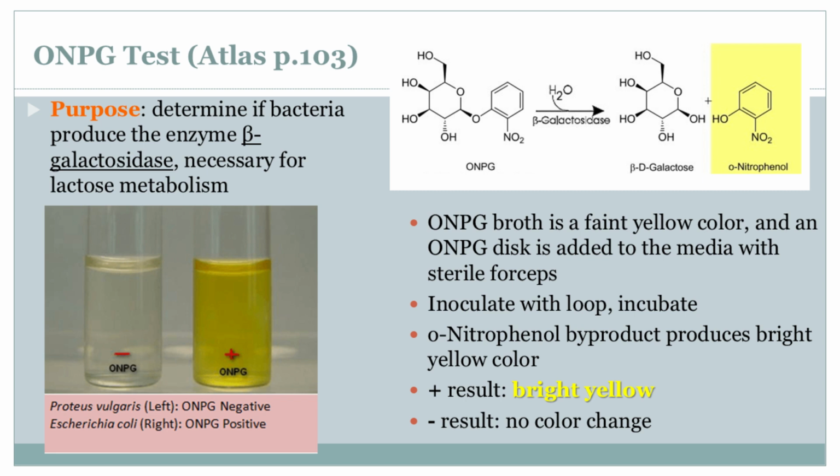So picture this. You've got a test tube with our bacteria suspects in it. We add the ONPG, and if those bacteria start producing galactosidase to break it down, boom, the whole solution turns yellow, like a signal flare. No way. So they're literally telling on themselves with this color-changing reaction. That's brilliant. It's like a science fair volcano, but instead of lava, it's lactose love. Exactly. It's a simple visual cue, but it tells us about this really complex process.